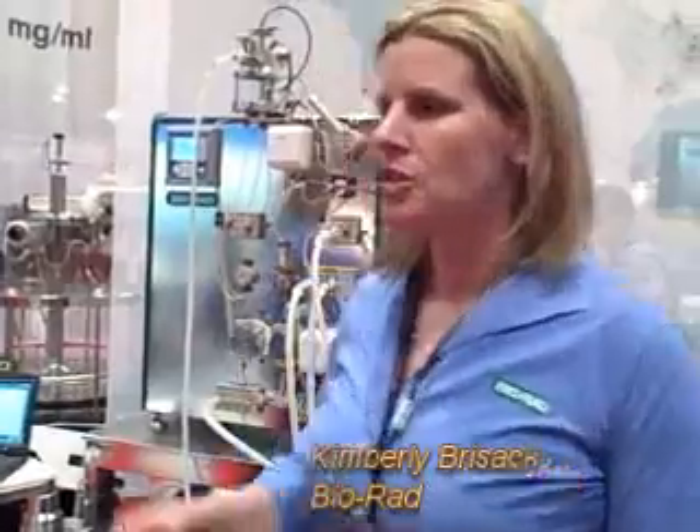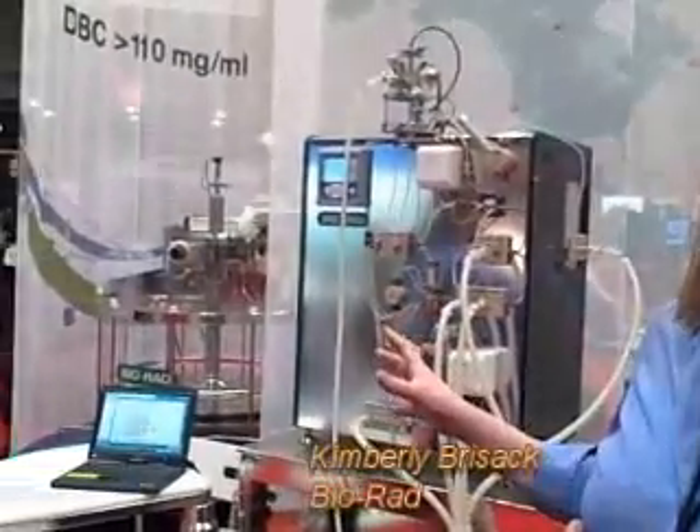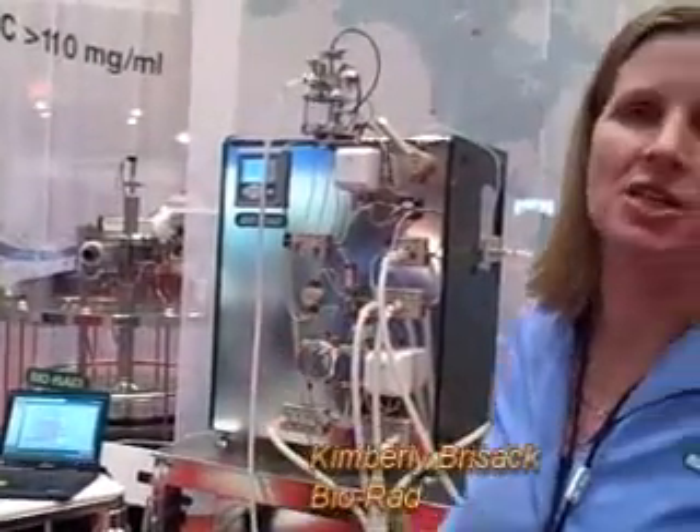We also move the piston of the column up and down. We have one computer unit which controls all of these functions — it controls the skid flow, the pumps used for transferring slurry in and out of the system, and the piston movement. What's nice about this integrated solution is that you can write programs or methods used in a manufacturing process that are reproducible, they're traceable, and you have minimal operator interaction with the system.